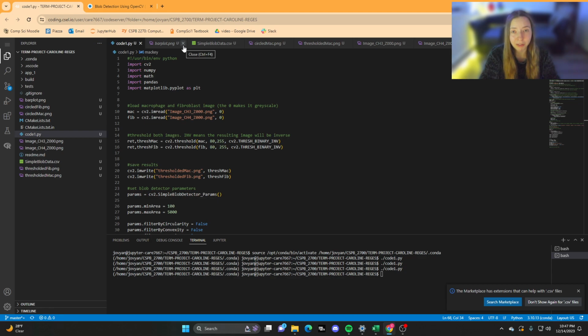And the great thing about this is this took me 20 seconds to load, but if I were to use Cell Profiler, each image takes about 10 minutes, and then if I were to use Imaris as another program to detect the distance, which cells are close and which are not, that could be another 10 minutes per image. And here I can just do it all in one place. It's just way faster. I'm just hoping I can get this working, and I think it would be really cool. Do some cool research.